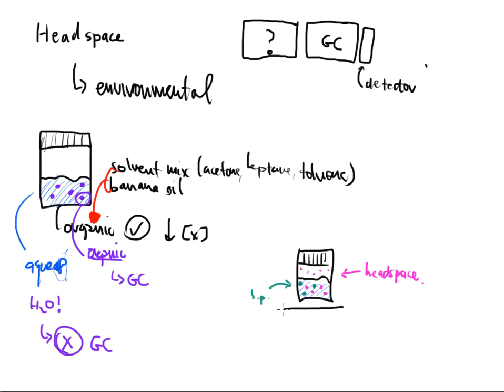So there's an issue here, and you might be actively thinking now, well, that's kind of easy to take care of. Let's put this on a hot plate, and let's turn up the heat, and maybe what I can do is warm this container up. And if I can warm this container up, I could maybe help drive off some of these components that might be a little bit stubborn.